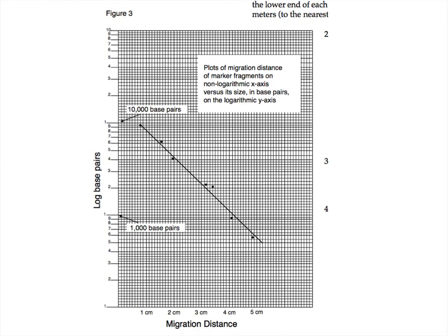Those of you who are very savvy on Excel, you can actually fix it so that Excel would do semi-log graph. And just a little pointers on how to set up the y-axis here. So if you look, it's in tens. So 1, 2, 3, 4, 5, and all the way to 9, and then 10, and then 1, 2. So you can see that it's in tens, right?